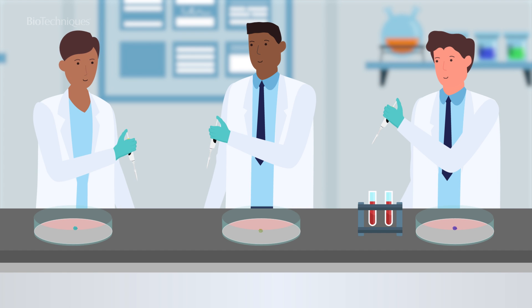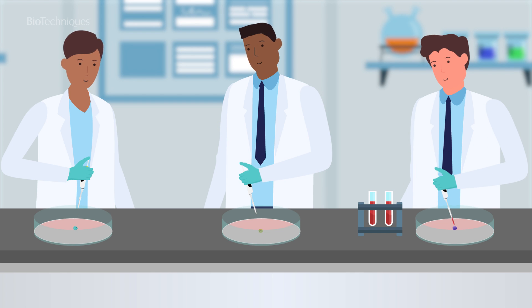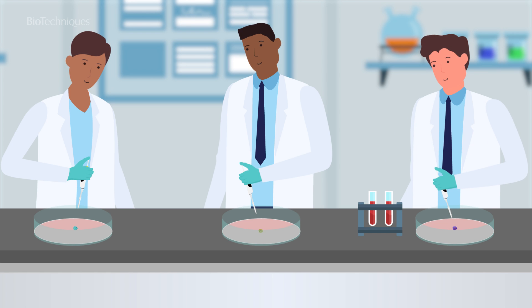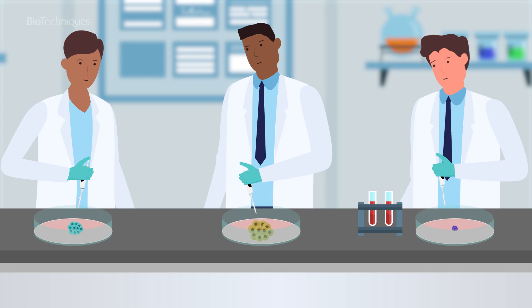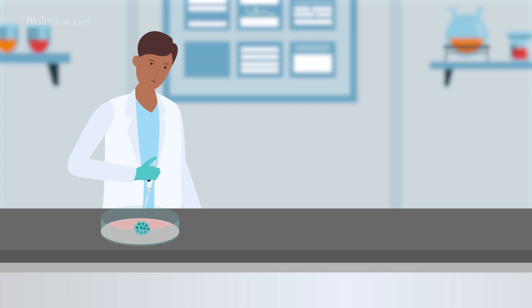One common challenge is pipetting. Pipetting technique can vary between people and research groups, and poor pipetting technique may lead to low reproducibility of samples and experiments. For example, poor cell seeding or pipetting of embedded organoids can result in differential growth rates. Difficulties are also faced when pipetting and mixing sensitive cells such as neurons, viscous extracellular matrices, or hydrogels.